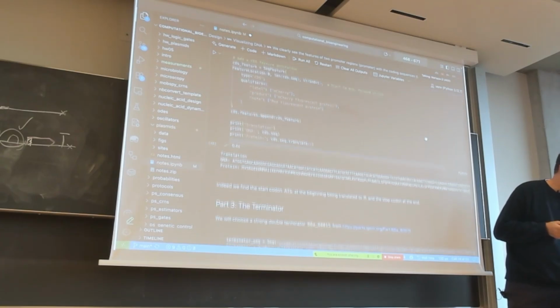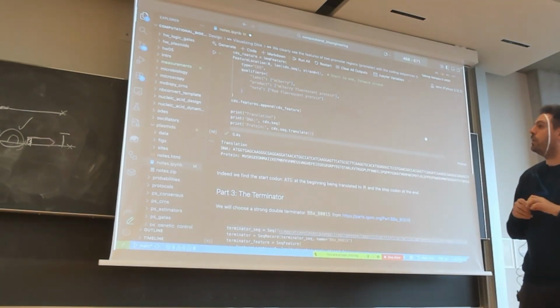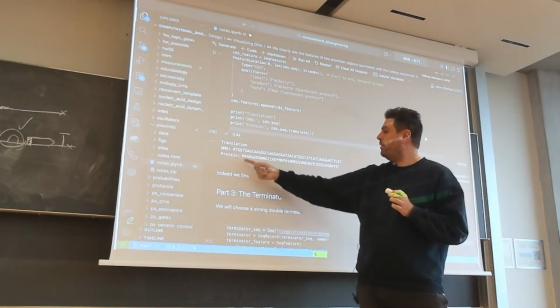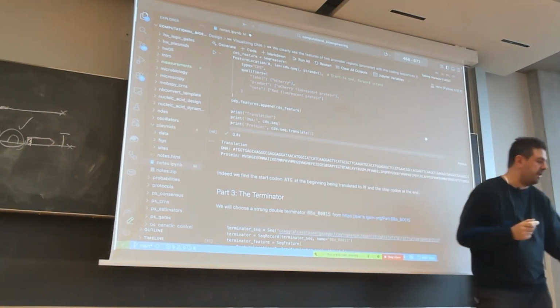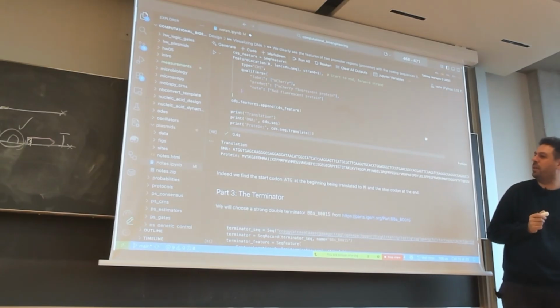And yeah, we are just checking. That would be a small assertion. I didn't put an assert here, but that would be a small assertion you can very nicely put here. We are translating it, and this should always start with an M. Not always, but if it's not, you should have a good reason.